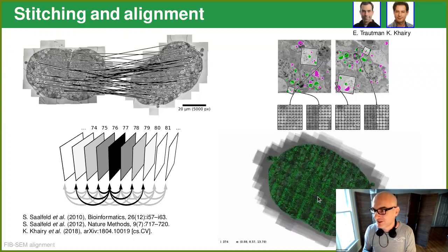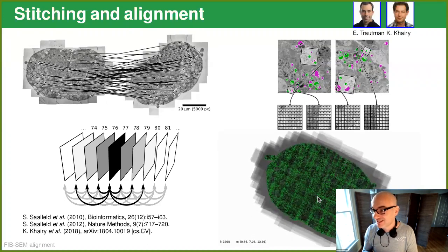And together with Stephan Preibisch, we've currently improved this, and we use his point descriptors to get even more control points in places where there are none, and to parallelize it better. So this pipeline is currently growing and improving.